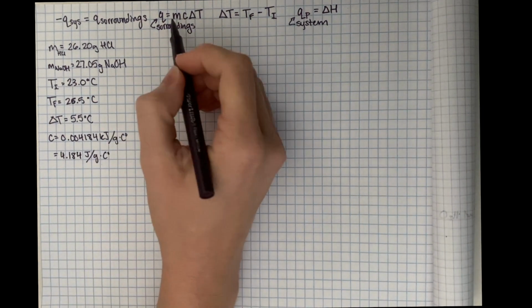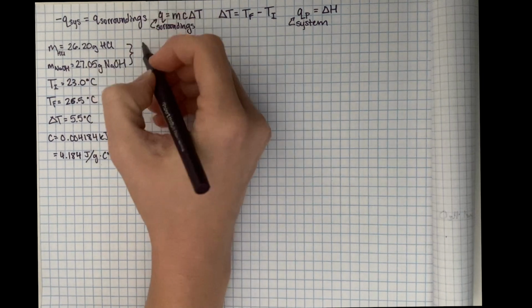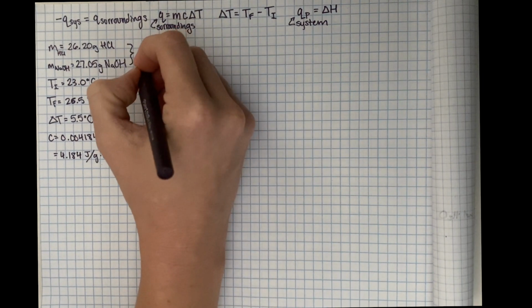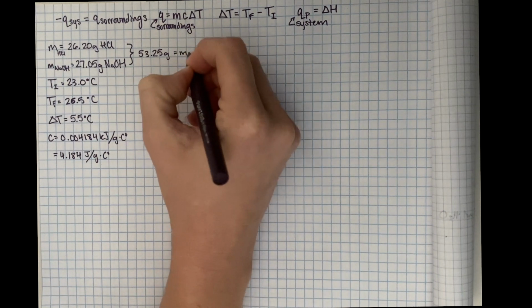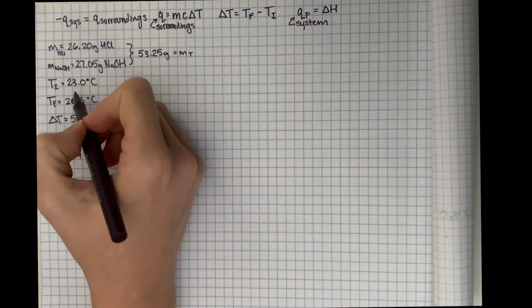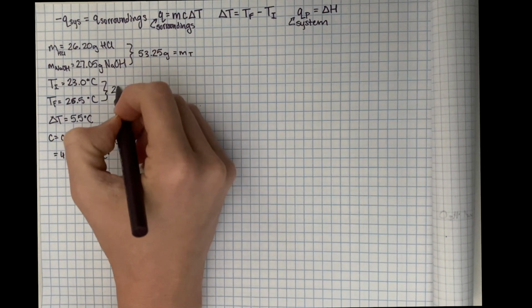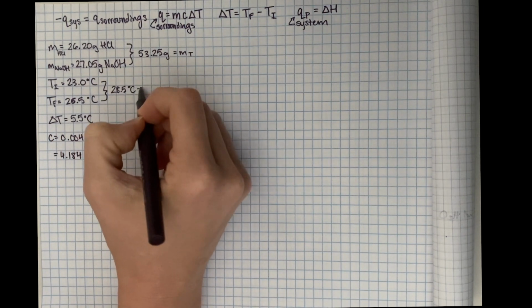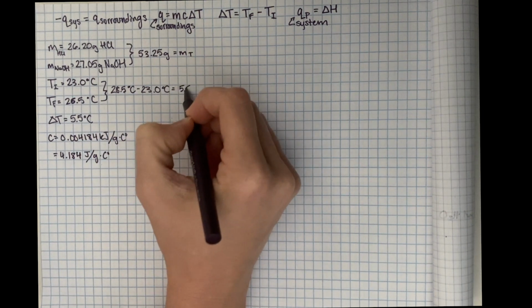We know the mass. We're going to add these together to get the total mass, which is going to be 53.25 grams total. And we can take our delta T, which is just the 28.5 minus 23.0 degrees Celsius to get 5.5 degrees Celsius.